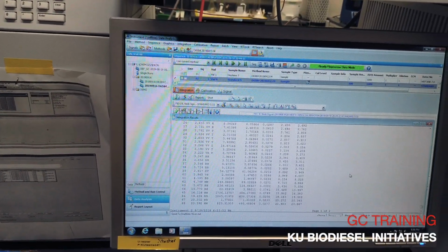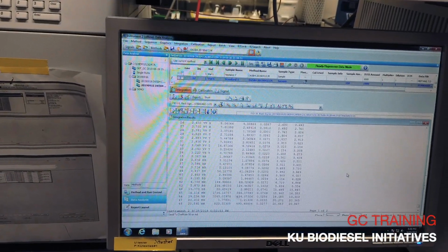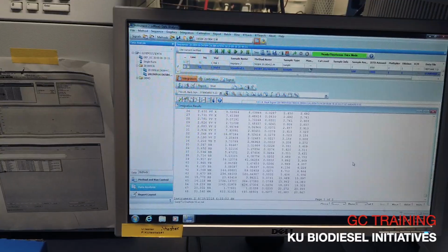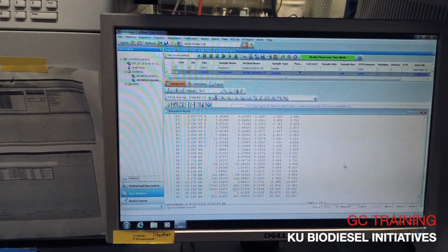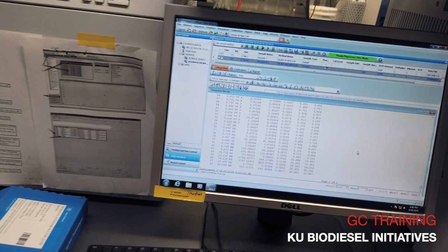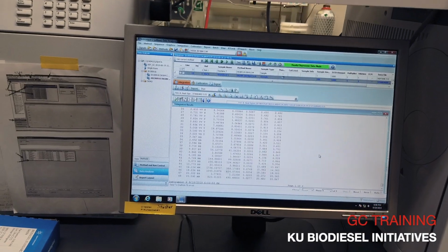And when you're doing an unknown sample, you know that the monoglycerides will be in that region. If you look at the end of the ASTM D6584 standard, it'll have a sample chromatogram. That'll give you all three monos, the two dis, and the two tris that will mostly be visible in a regular sample.